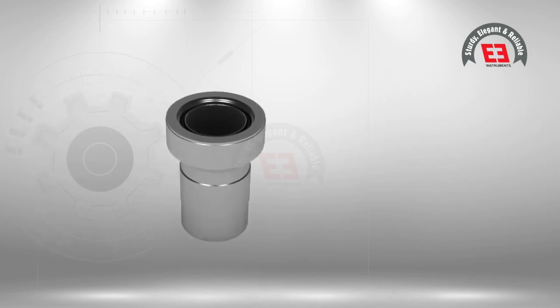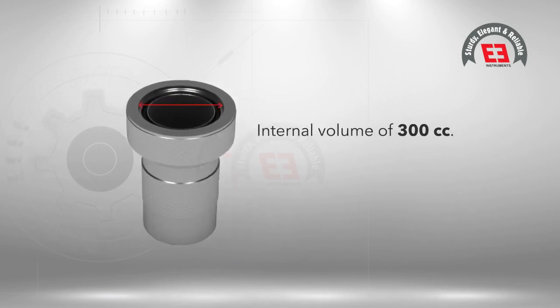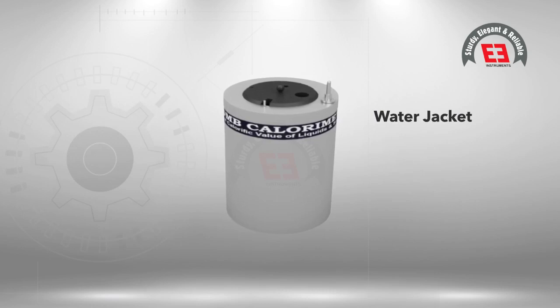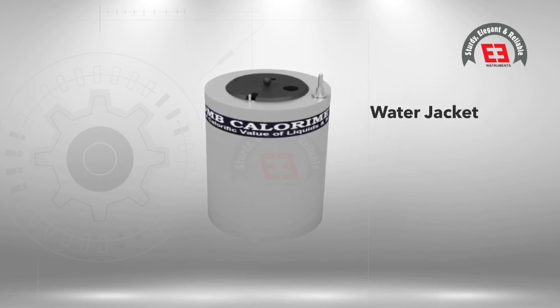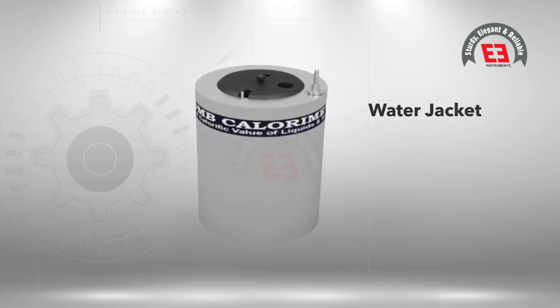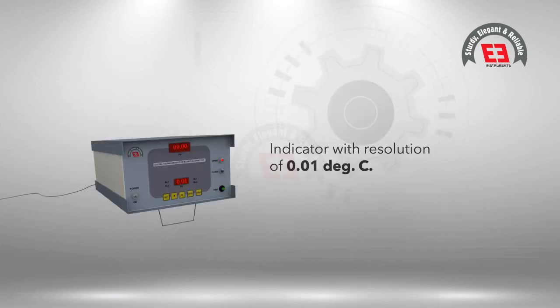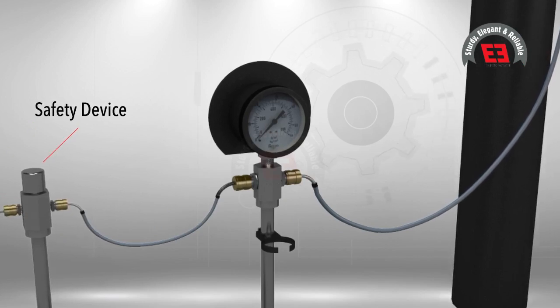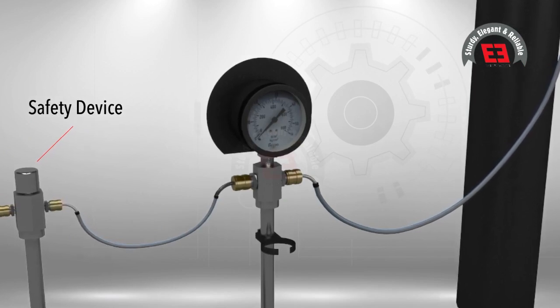Apparatus: The apparatus consists of a bomb of approximately 300 cc internal volume made of stainless steel, a calorimeter vessel made of copper chromium plated, a water jacket of stainless steel highly polished to eliminate the effect of external temperature change on the temperature in the calorimeter, a stirrer driven by a motor, and a firing unit with digital temperature indicator with resolution of 0.01 degrees Celsius.